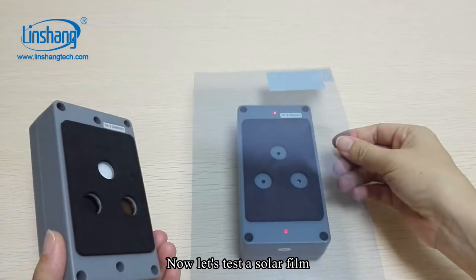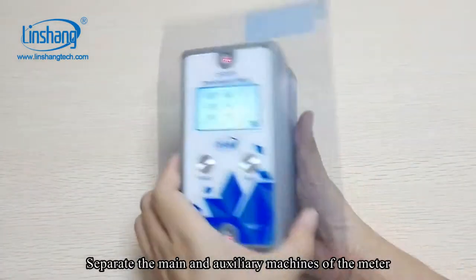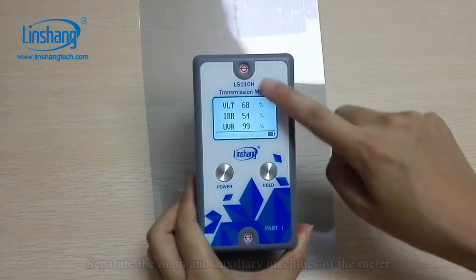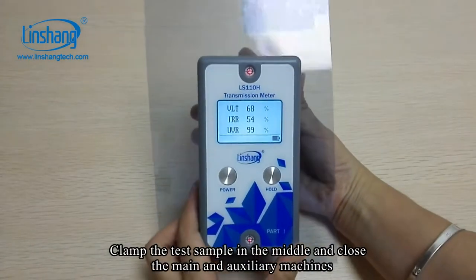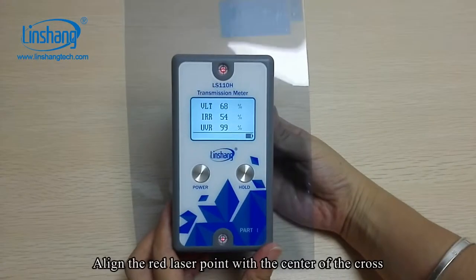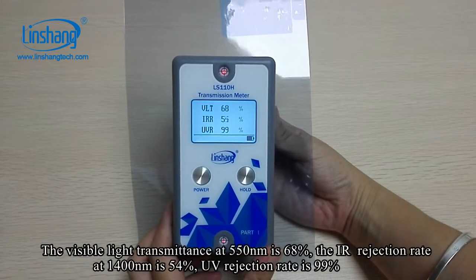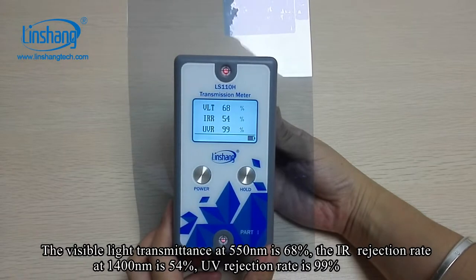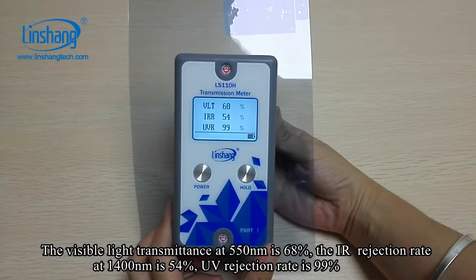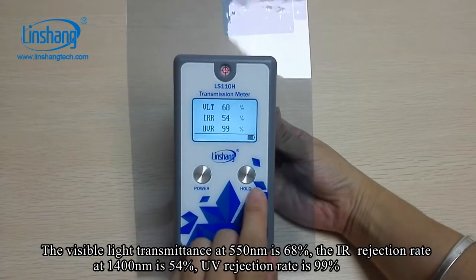Now let's test a solar film. Separate the main and auxiliary machines of the meter, clamp the test sample in the middle, and close the machines. Align the red laser point with the center of the sample. The visible light transmittance at 550 nm is 68%, the IR rejection rate at 1,400 nm is 54%, and the UV rejection rate is 99%.